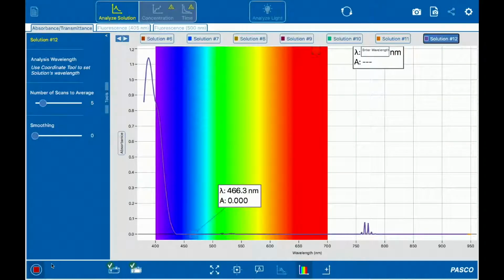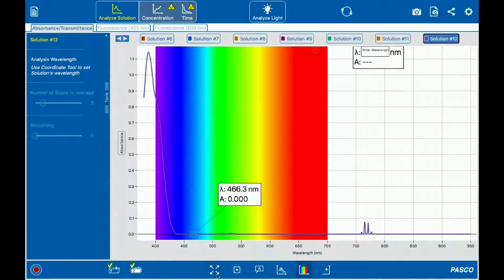So what we're going to do is pop this in the spectrometer, and we're going to record some data. Oh wow! And look at how much this differs. So just in a rapid comparison, in fact, the peaks are gone, right down to it.